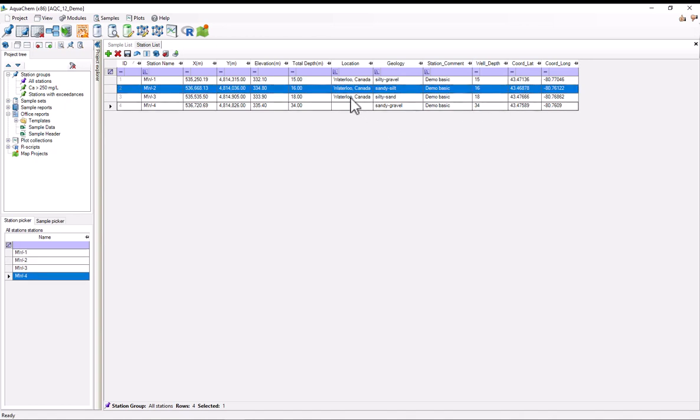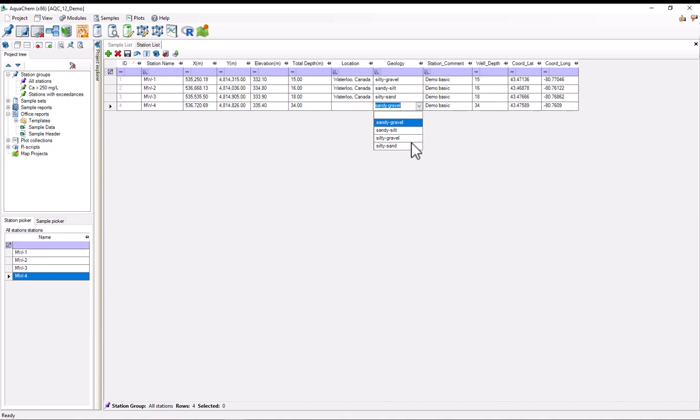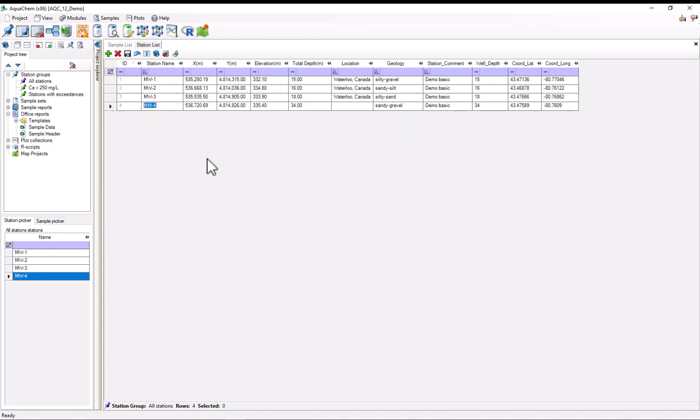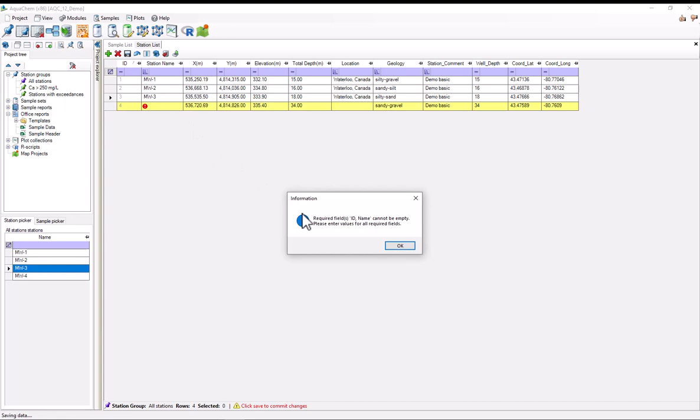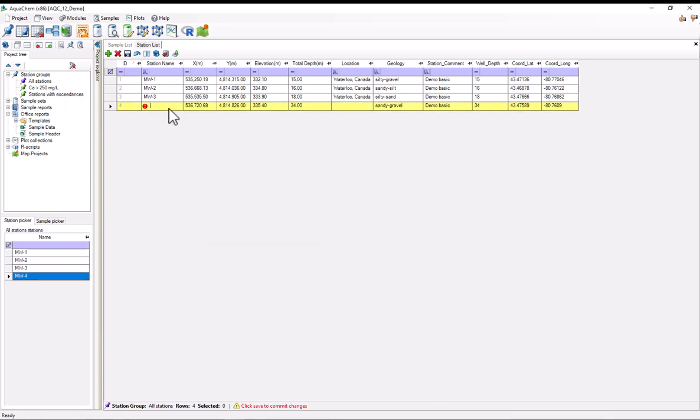For example, this location field is not mandatory. And in this example, I've left it blank. Some of these fields might be drop downs. This would be up to the user to set up. And some of these fields are mandatory. So like the station name, it cannot be left blank. So that's illegal. AquaChem won't let me do that.